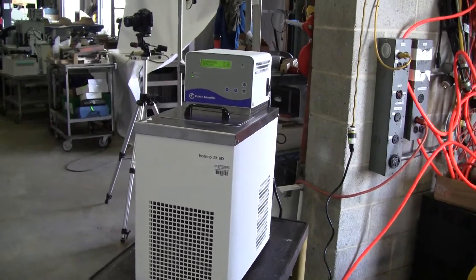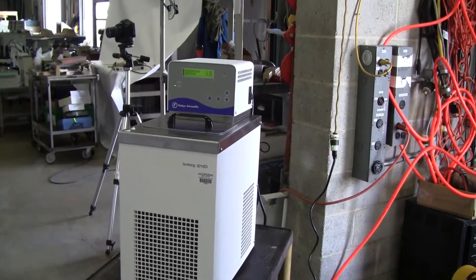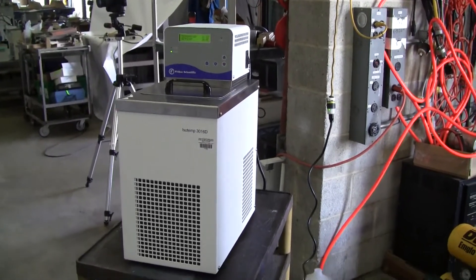Hi, this is Jim from High Tech Trader. We're looking at a Fisher Scientific ISOTEMP 3016D heater and chiller.